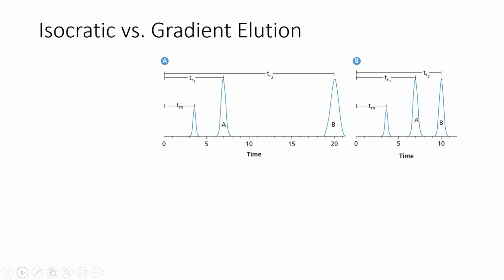Okay. So iso, prefix meaning? Same. The same, right? So this isocratic, right, uses the same solvent, the same mobile phase throughout.